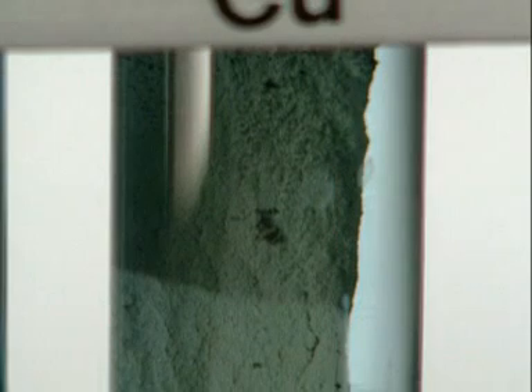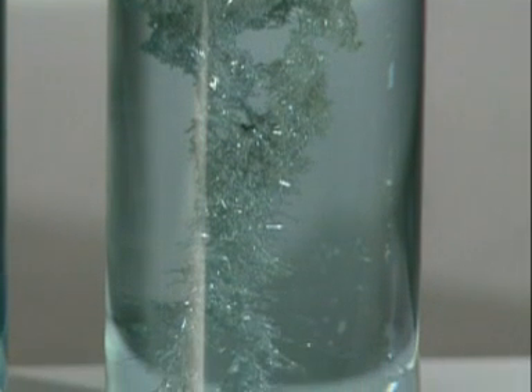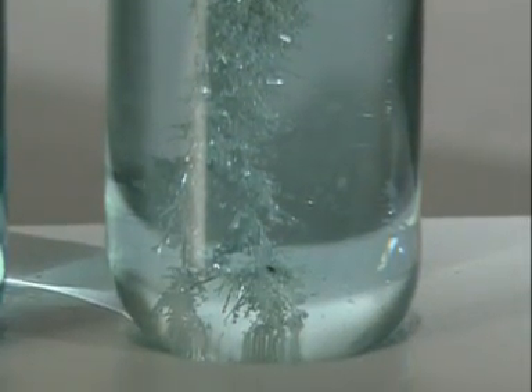You can actually see crystals of silver growing on the copper strip. After several hours, there's so much silver it glistens, and the colourless solution is starting to go blue.